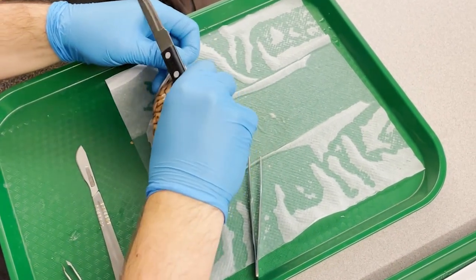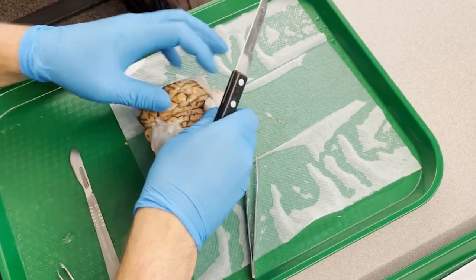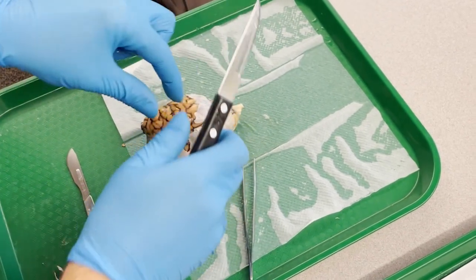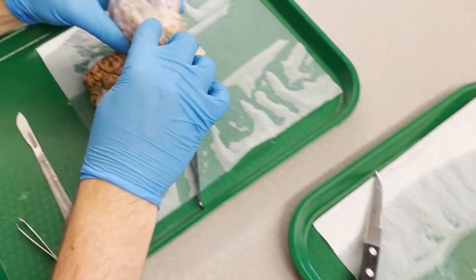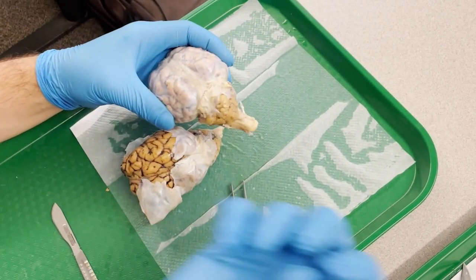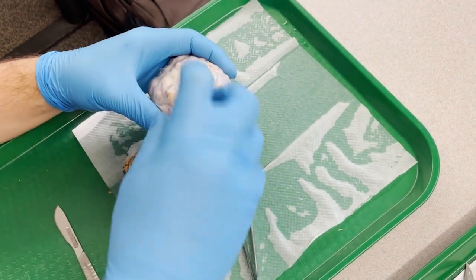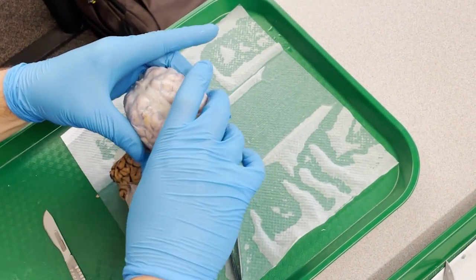And once we get to where the cerebellum is, that's where things get tricky, because it's actually rooted in between the hemispheres and the cerebellum. There's this gap. You can almost see it on this one. Let me just pull this over here. There's three different bulges of the brain: the back of the cerebral hemispheres and the bulge of the cerebellum. The dura mater takes a really big chunk of itself and winds its way deep in there.